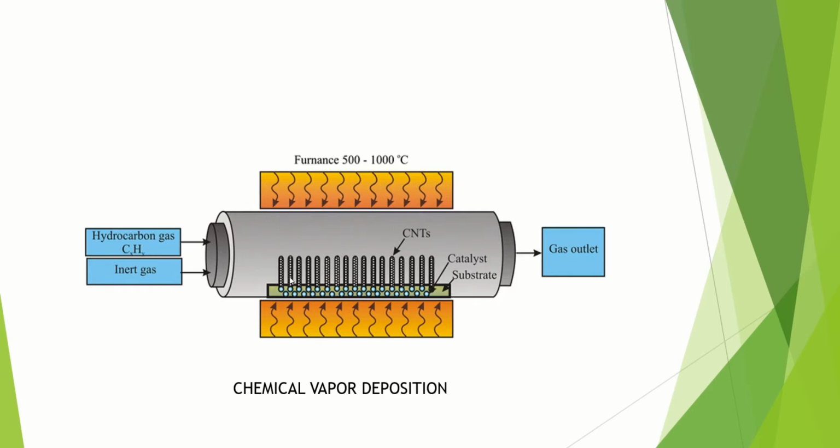Here's how a CVD furnace looks. Precursor gases and carrier gas flow in one side. They pass over a heated catalyst inside the quartz. The reaction happens and your product is finally there.